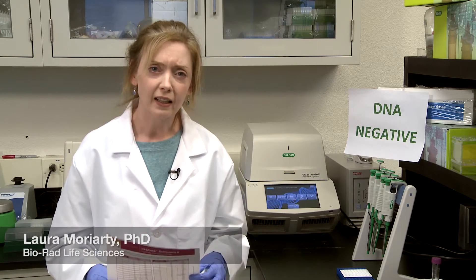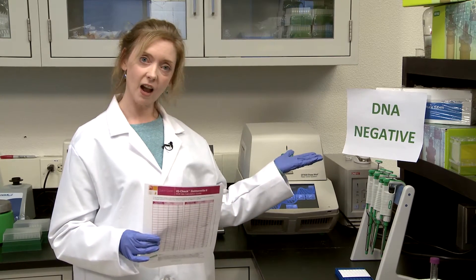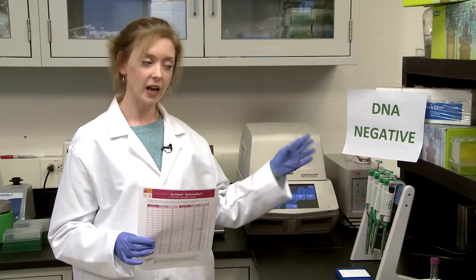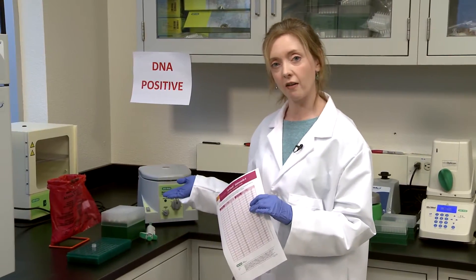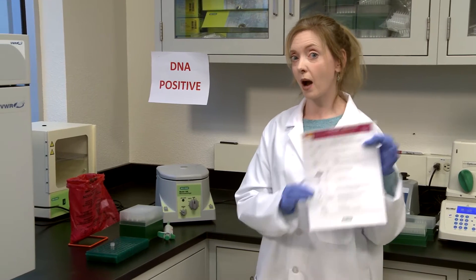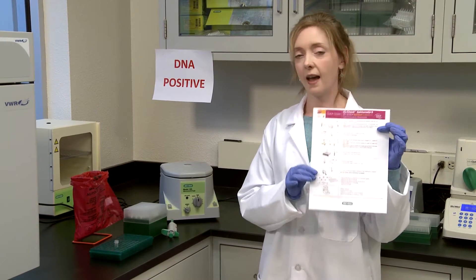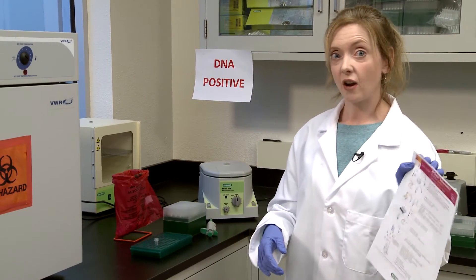Welcome to the IQ Check standard extraction protocol training. Here I am in my lovely lab — on the left hand side we have a DNA negative area, and on the right hand side we have our DNA positive area. We also have separate pipettes in each area to avoid contamination. I'm carrying my wonderful quick guide; it's excellent to keep with you at all times — just print it out if it gets a bit grubby.